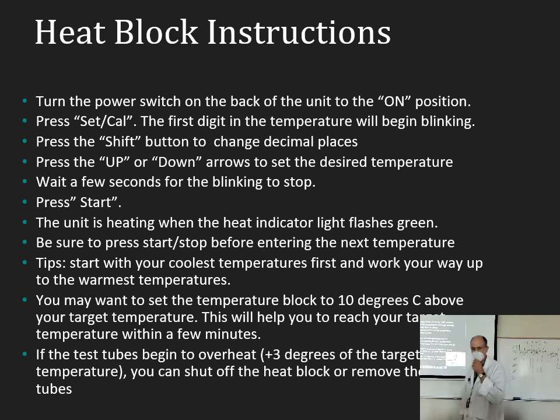And one last thing, when you do go to collect your data, remember last time, you click collect data about 5 seconds before you mix the two things together so you have a flat line. When you put the cork on, it's going to make a little bump. You don't want to count that initial cork going on as part of your data. And then you'll get a slope of the first several seconds of the reaction once it begins. So things to think about when you're doing that.